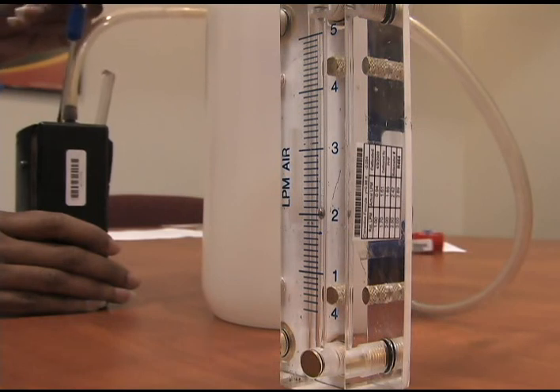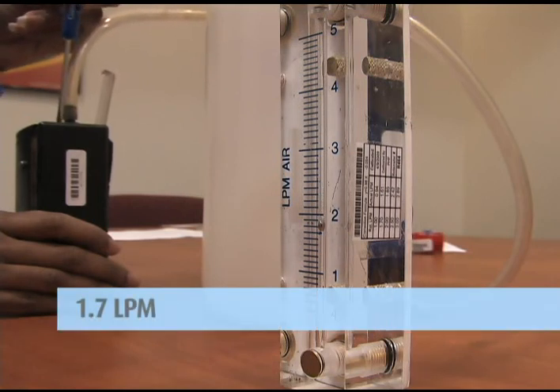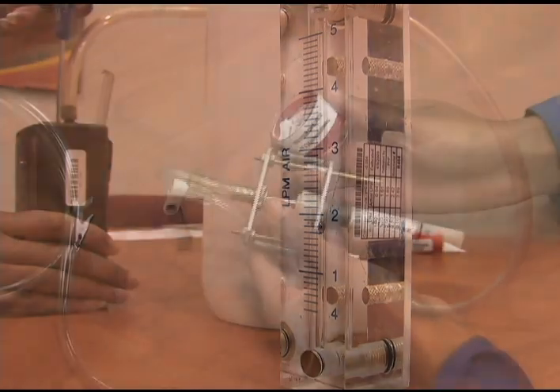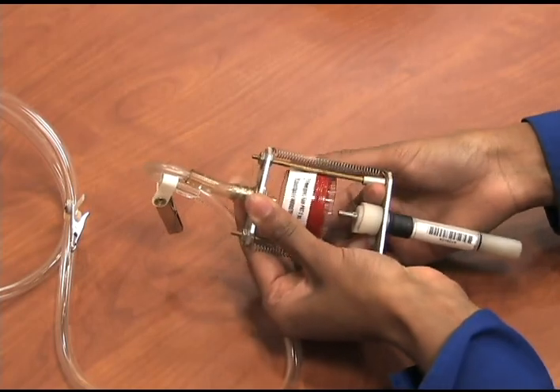Be sure to take your rotometer reading at eye level and use the center of the float for the value. The required flow rate range for respirable or silica sampling is 1.7 liters per minute. Verify the flow rate against the pump calibration data sheet.